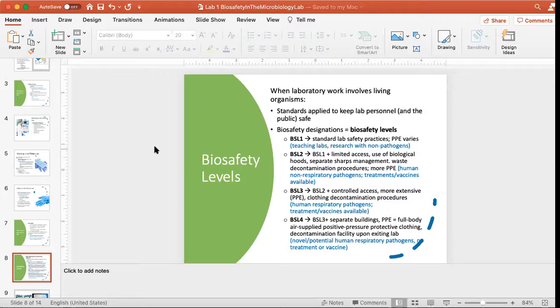So a pathology lab, for example, that deals with human tissue, or perhaps a diagnostic lab that works with human samples, or again, a microbiology lab that works with microbes. Anytime you're dealing with a laboratory that works with living organisms, living cells, it has to be assigned what's called a biosafety level. And we shorthand that as a BSL.